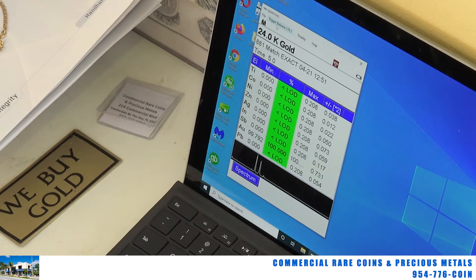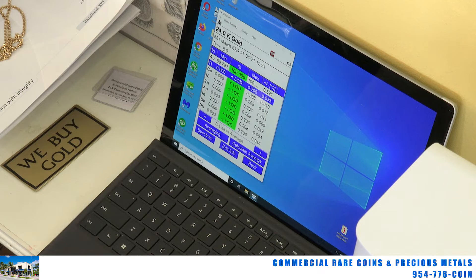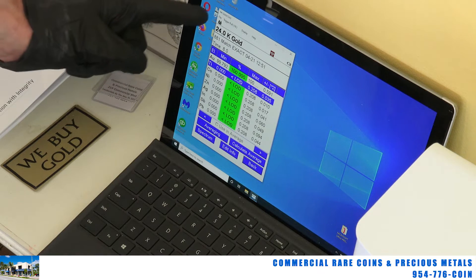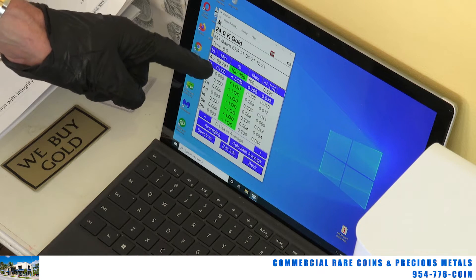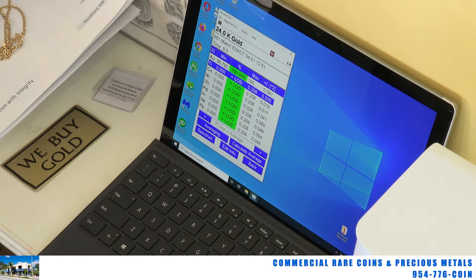What we should come up with is 24 karat gold, as it says right at the very top there. You'll see AU — which is gold — and these are showing up as 24 karat gold. These machines can have a 1% variance. With this 1% margin, you can see this 24 karat maple leaf comes up at 99.79%, when it really is 99.9%. The margin of error can be up to 1% on some of these machines, depending on the brand, age, and maybe other factors.